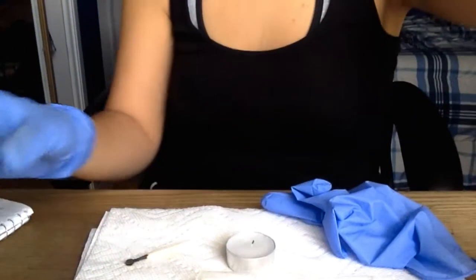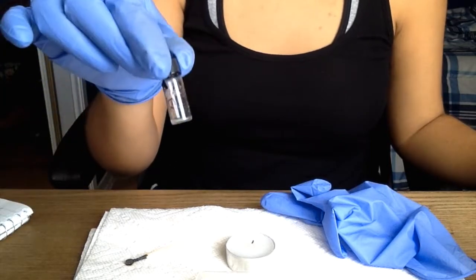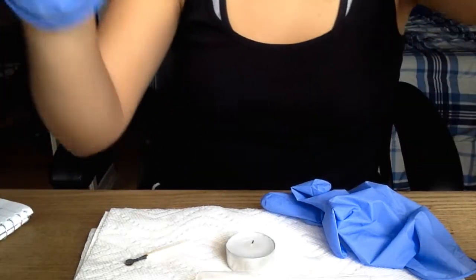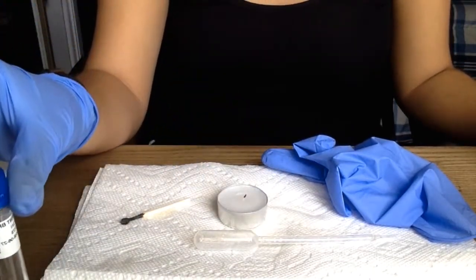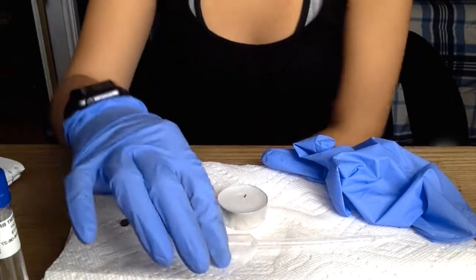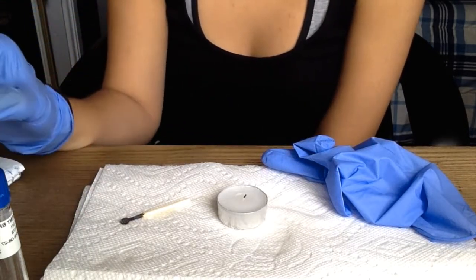I'll go ahead and show you my original nutrient broth, the vial of the E. coli culture that I just used. I have a little more. The candle here, which I used to sterilize both the lip of the nutrient broth and the E. coli.